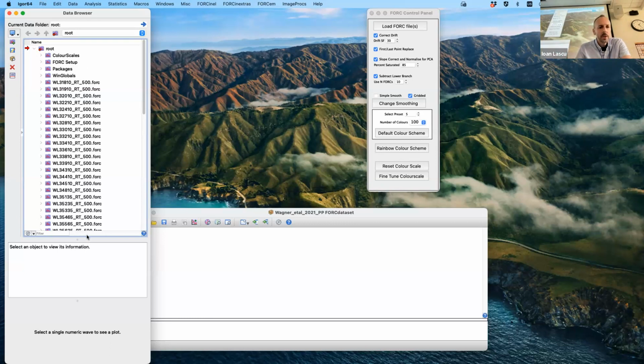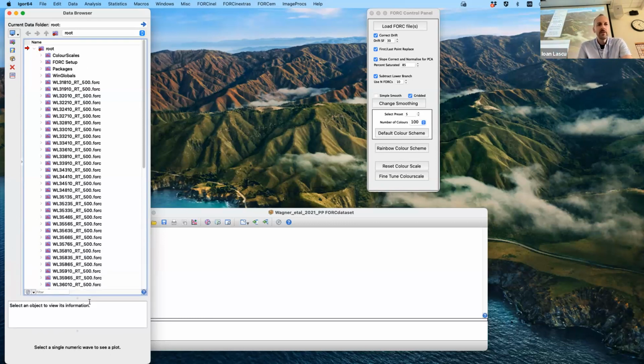And so right now we're looking at the 65 FORCs that Courtney collected from Wilson Lake, New Jersey. It's a section from the PETM, the Paleocene-Eocene Thermal Maximum. A nice thing about this data set is that you can use PCA to separate out different magnetofossil populations. These are magnetofossil-rich sediments, and using FORC-PCA we are able to pull out different types of magnetofossil morphologies that give different coercivities.